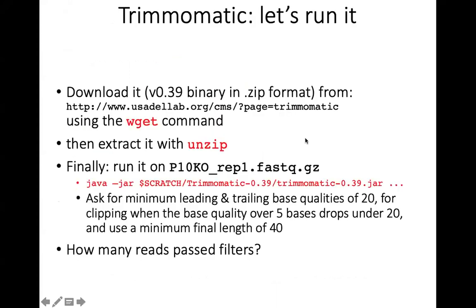Okay, so read filtering. Basically, the run just looks good, and most reads are good. The next thing we're going to want to do is not just throw all the reads into the alignment, because some of the reads are not as good. There are just a few reads that are always bad, so we just want to remove those. And then for some reads, something happened, and the average read quality just dropped after a number of bases. So we're going to remove the bad reads and then trim the reads when they quickly drop in quality. So just remove the bad bases, remove the bad reads. And we're going to do that with Trimmomatic.